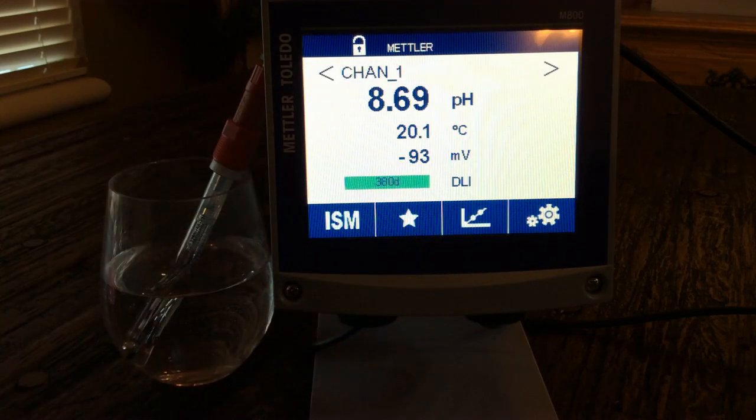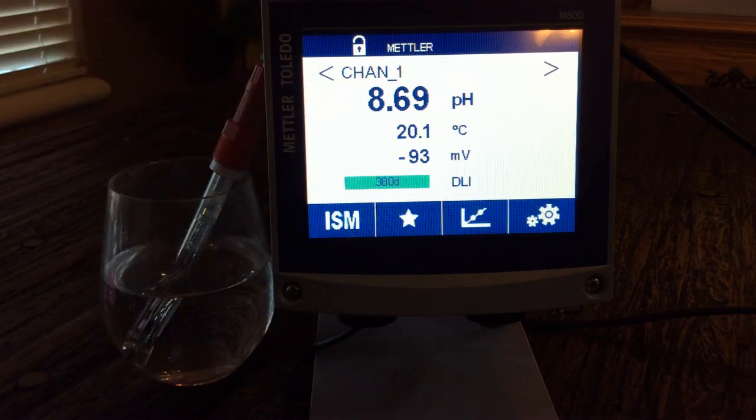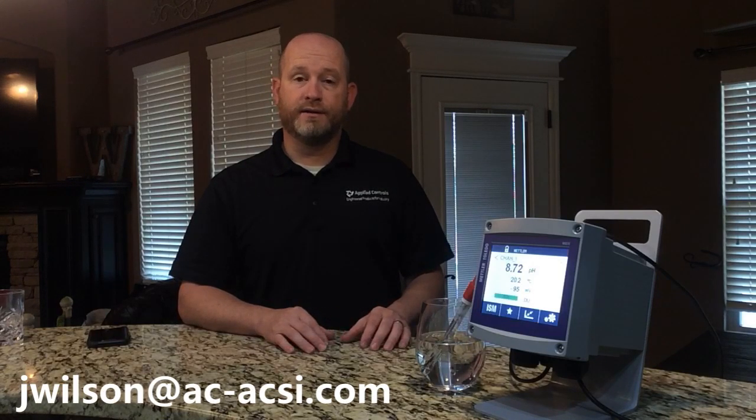Going back to the home screen, that's just a little bit of the basics. If I had multiple channels I could view channel two, three, and four, but I only have one hooked up. The M800 transmitter offers a lot of benefits and will make your application simple and easy. For help with your next application, please contact me at jwilson@ac-acsi.com or give me a call at 405-255-9440. I'd love to help. Thank you so much for watching today.